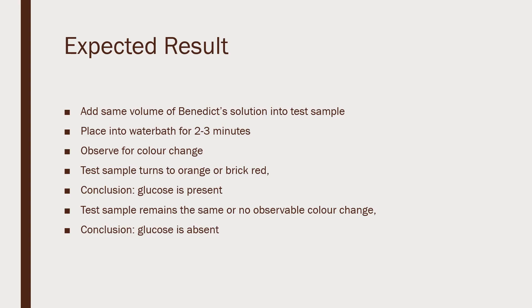For this experiment, we have to add the same volume of Benedict's solution into our test sample. We have to place it into a water bath for 2-3 minutes.